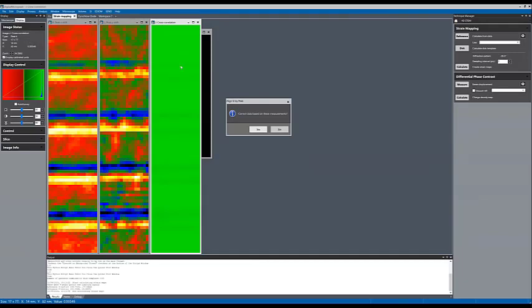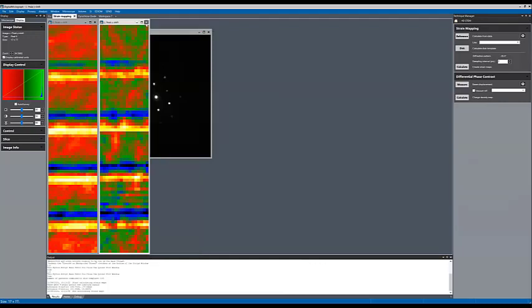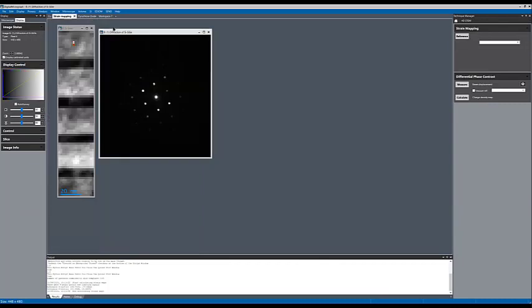This tells you how well the cross correlation worked, and you can change that in a tag. If it is 1, it worked perfectly. If I have set it to less than 75%, then it's going to fail and turn red. If I'm happy with this measurement, I can say yes, I want you to correct this data based on this measurement, or I can say no. Sometimes you have to look at the results and see if they make sense, and if they do, then you can apply that.